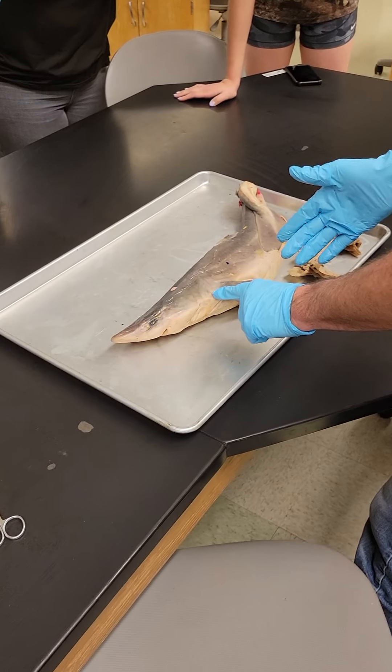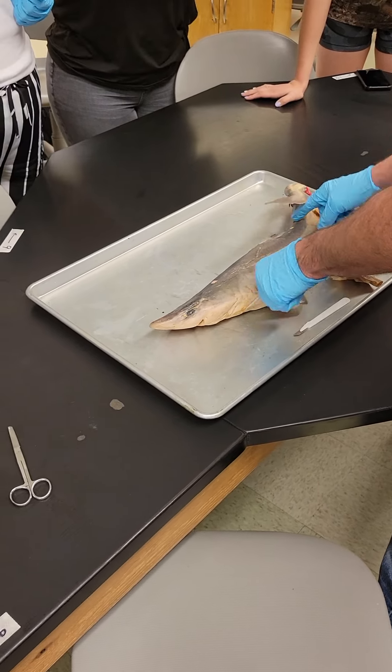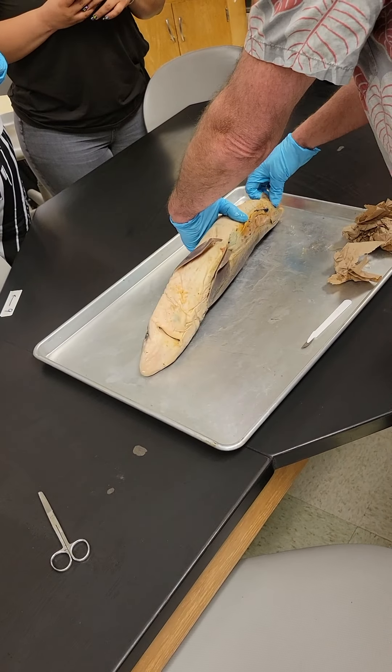Then we have the five gills: one, two, three, four, five. Pectoral fins, pelvic fins. This is a female because it doesn't have claspers.